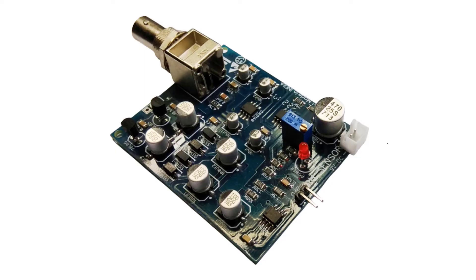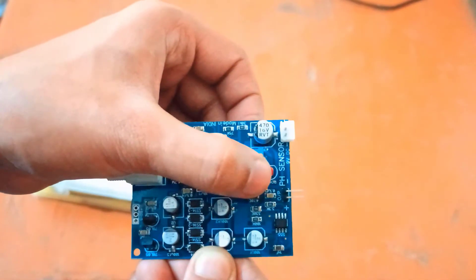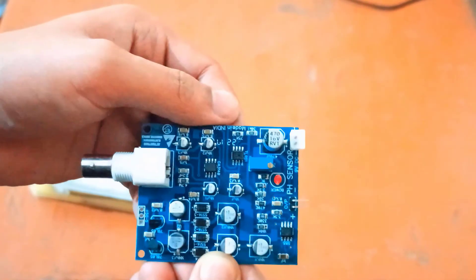This instrument is calibrated for the pH sensor provided along with this kit. If there is wrong reading, you may need to adjust this for recalibration. This is the power LED that turns on when the power is applied to it.